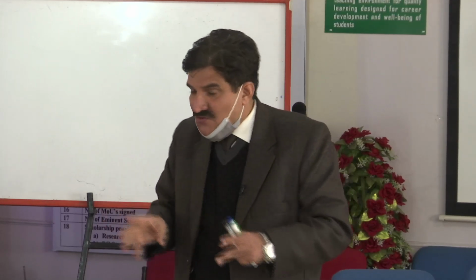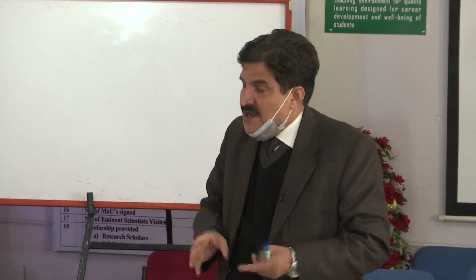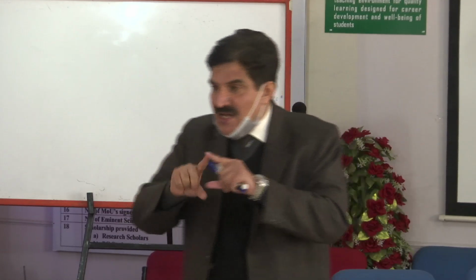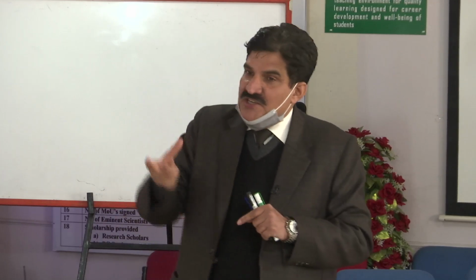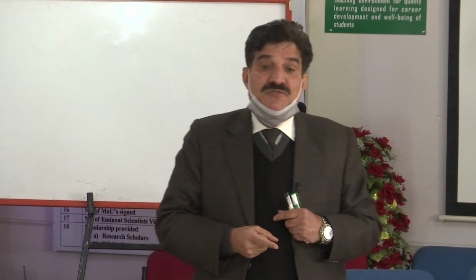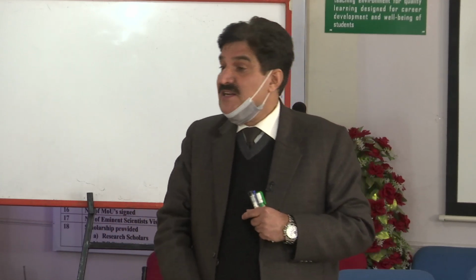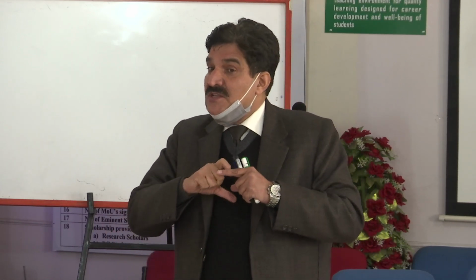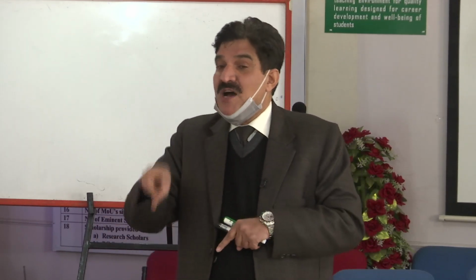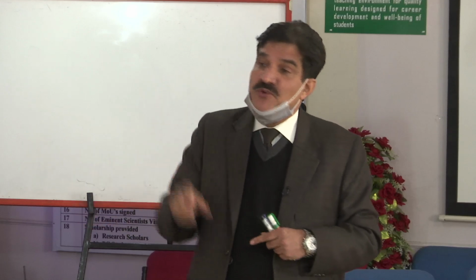So rupturing of the cell wall and cell membrane is taking place, and after that nucleoproteins are coming out. Nucleoproteins are also separated out because of the detergent action. Not only this, sometimes we require magnesium chloride concentration, in order to have organelle separation, or separation of RNA from nucleoproteins or DNA from nucleoproteins.